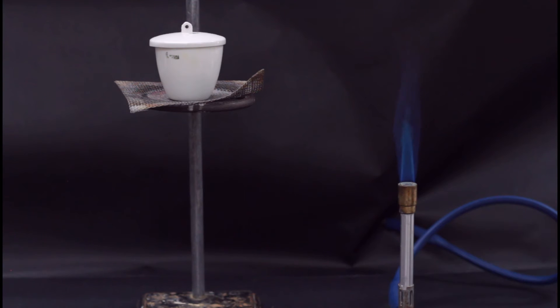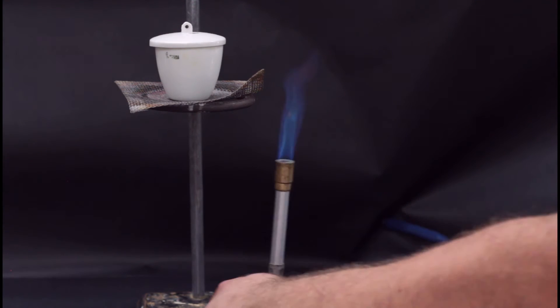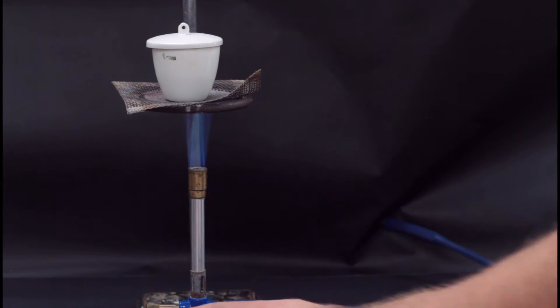Light your Bunsen burner and begin heating the crucible. Heat it for about five minutes and then check the mass.